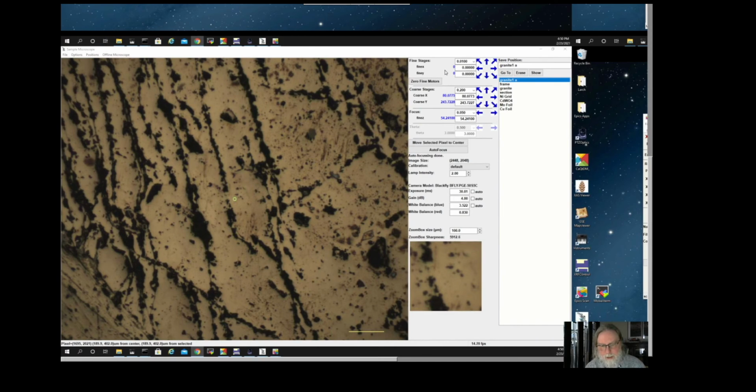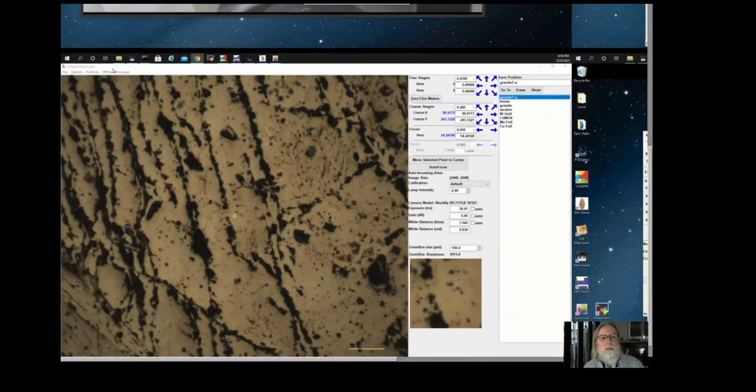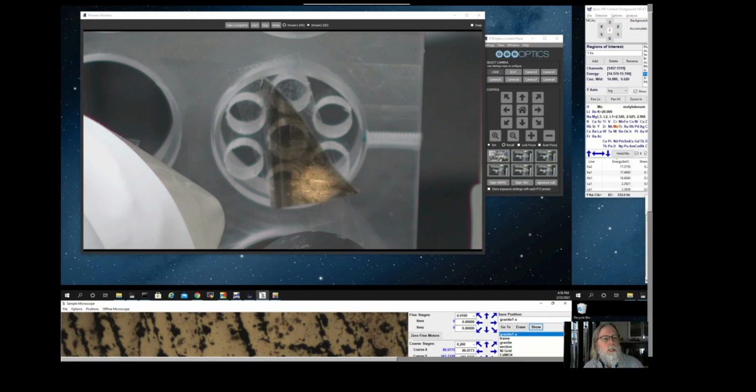Finally, I will say that if you are at the beamline, or you're sending us samples that you have good optical or backscattered images of, and you know exactly where you want to analyze, we can use our offline microscope with these sample stages and save positions and then transfer the positions from our offline microscope. That works pretty well to within 100 microns or so, so within the field of view, so that we can pre-find many points to analyze in your sample, and then you can refine those instead of having to hunt around with this combination of only a 1 millimeter field of view and only this sort of 1 inch round field of view.